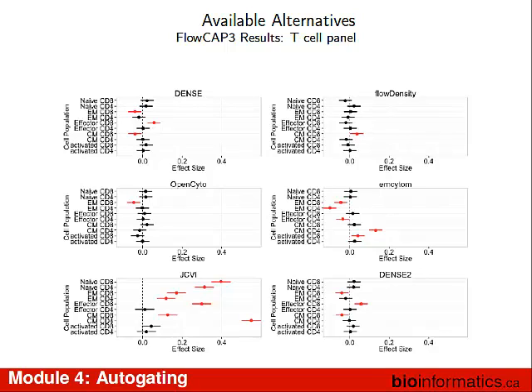We're trying to measure the variation due to manual versus automated gating, and get rid of the effects that are due to things that aren't gating. If you have data from different centers, you can have an effect due to the data coming from a different center. So it's like a batch effect. We were trying to account for all these different batch effects that we knew would be there, and one of the obvious ones was coming from different centers.